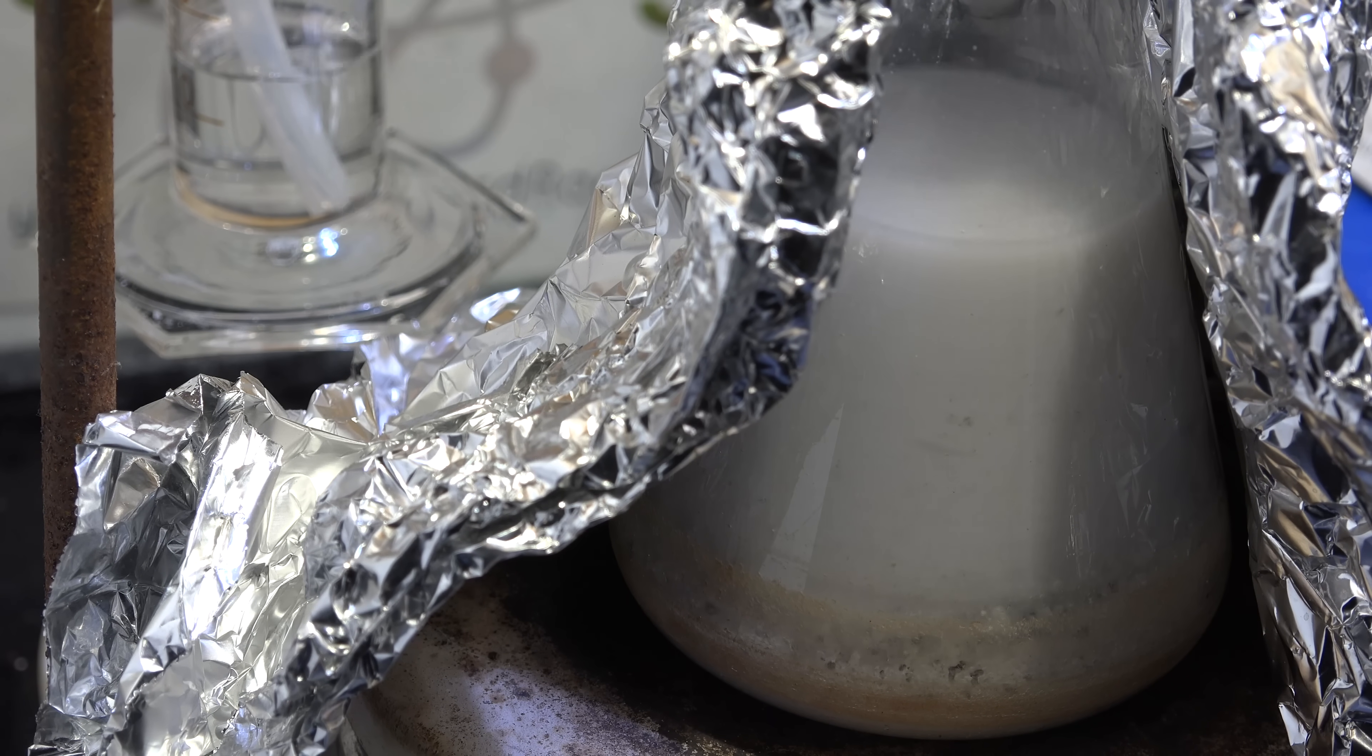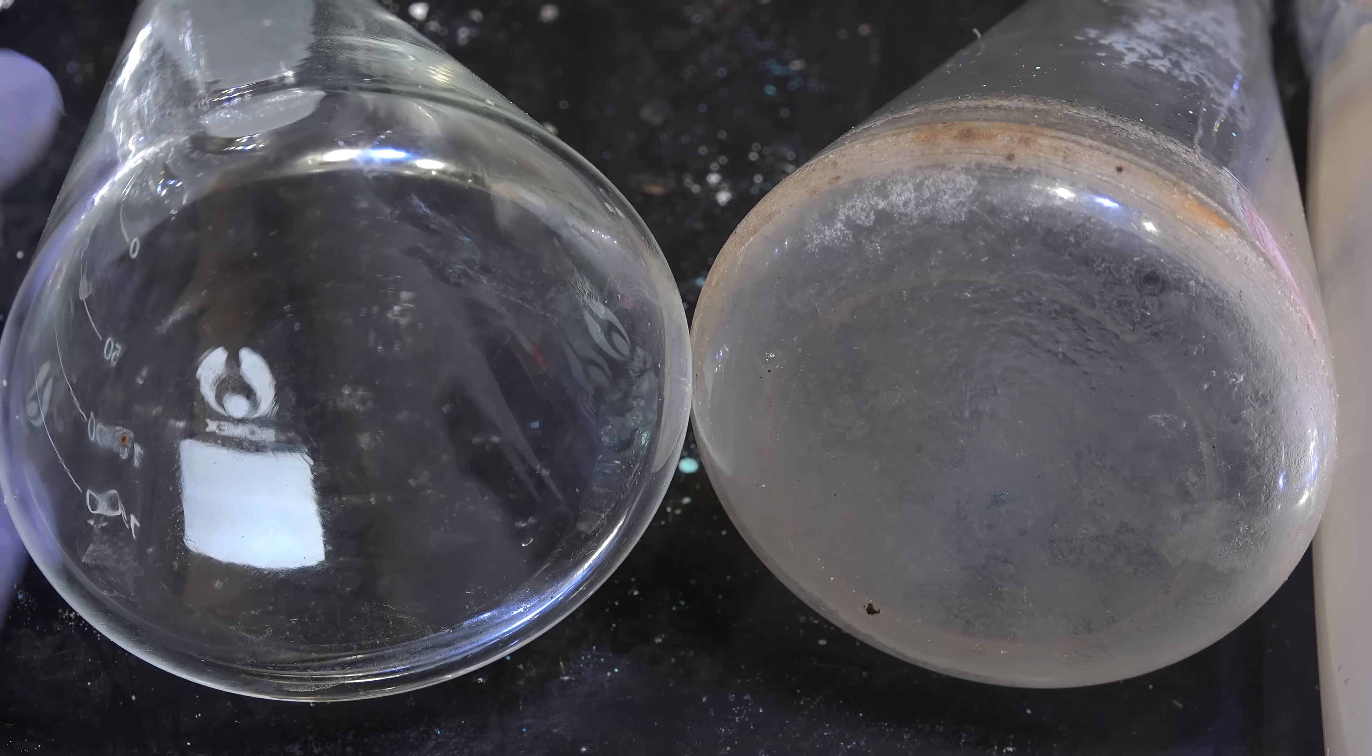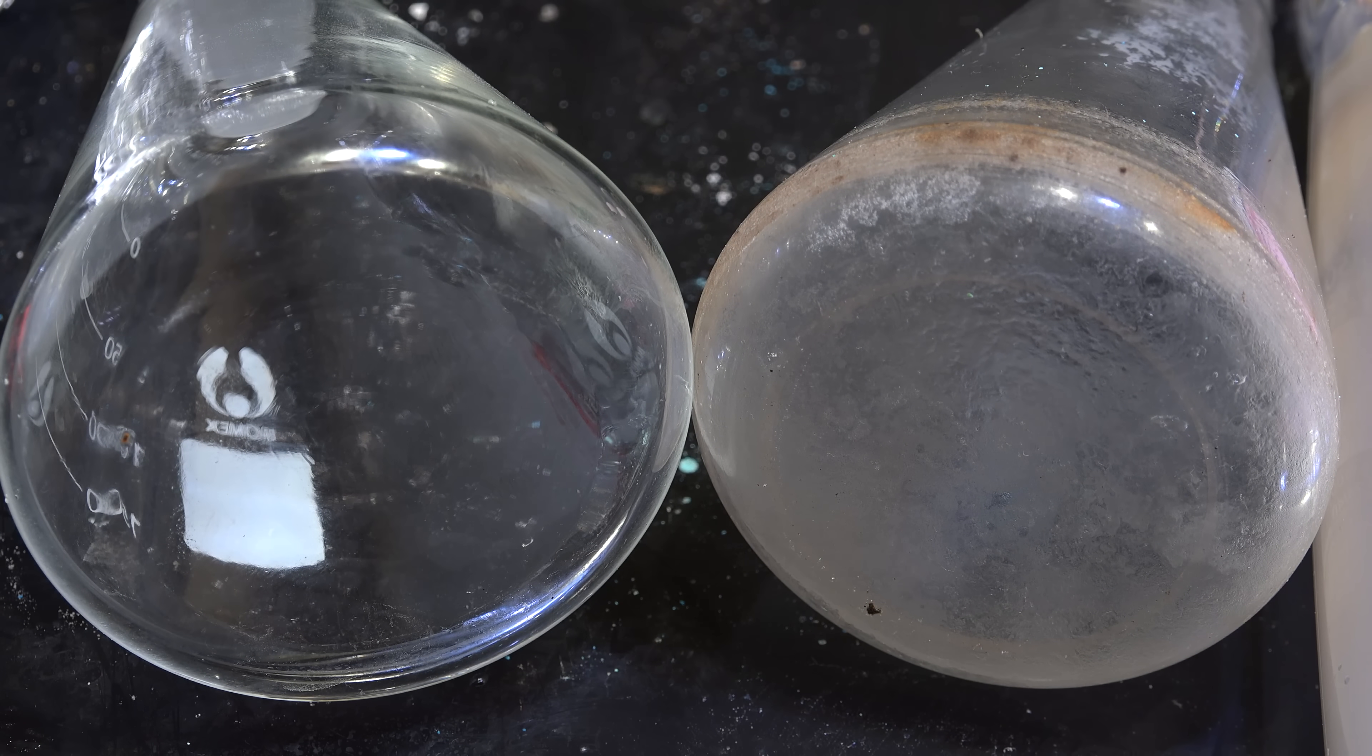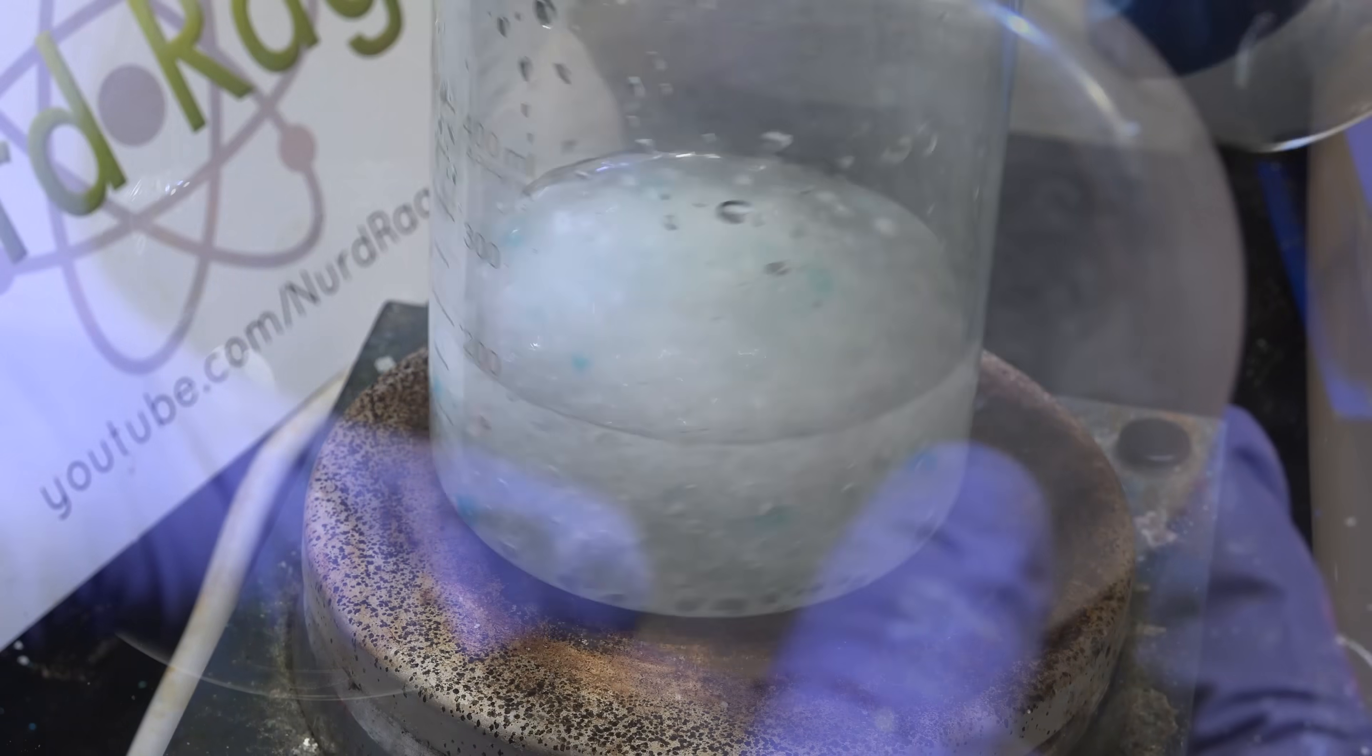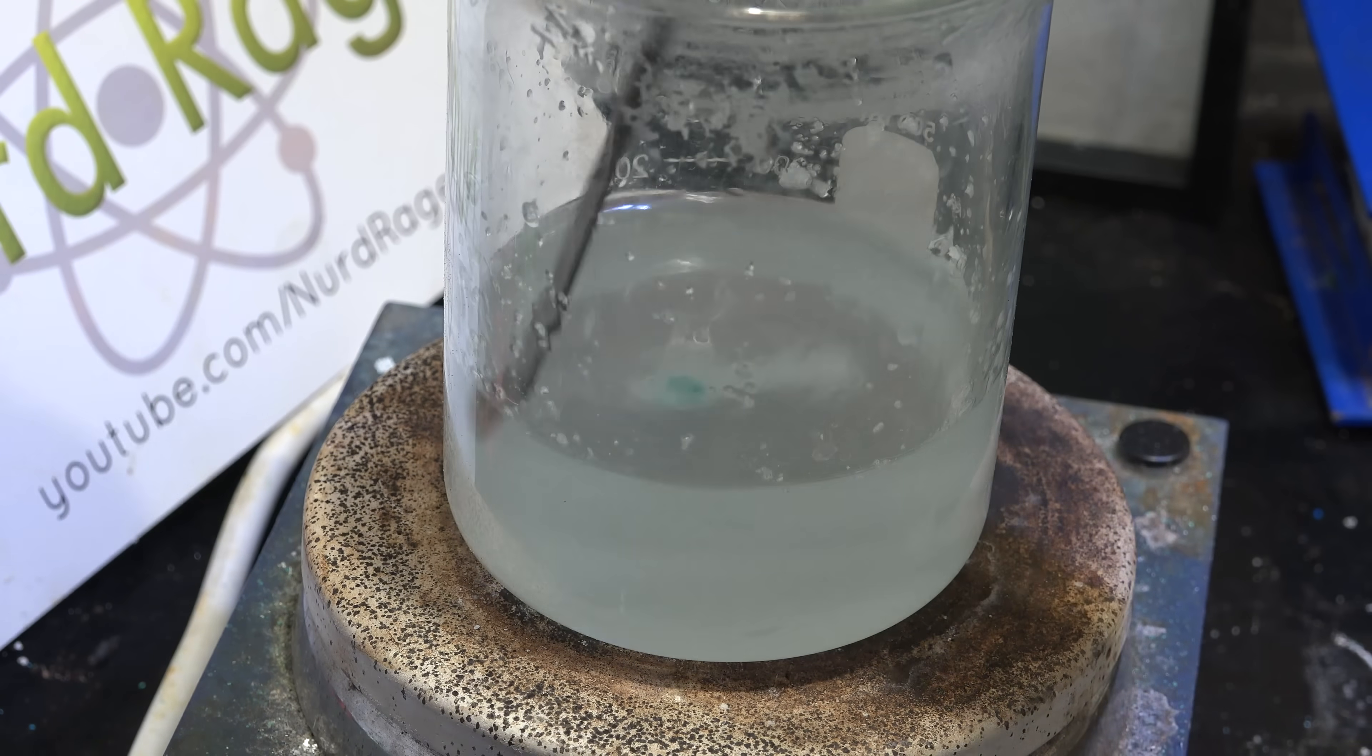The second issue is damage and cost. The reaction mixture is very damaging to glassware. Expensive borosilicate laboratory glassware. Sodium hydroxide is well known for dissolving silicon dioxide, including the silicon dioxide that glass is made out of. In fact we exploit this property to make sodium silicate as shown in previous videos.